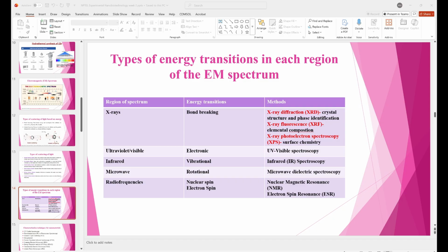So for that, what if a molecule has conjugation, that makes it UV visible spectroscopy active. If you have a linear molecule without any conjugation, you will not get any peak in UV visible. Visible, you will get a peak if there is some color. But a UV peak you will not get until and unless you have a conjugation. So there are 3 or 4 electronic transitions which make the molecule UV active.